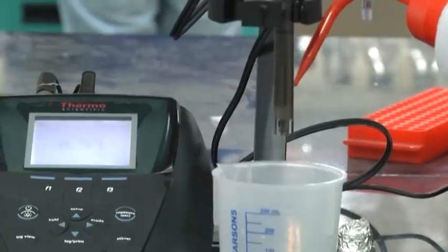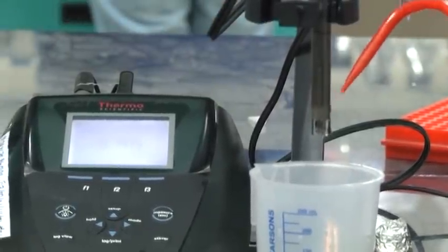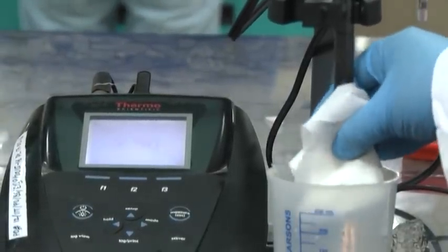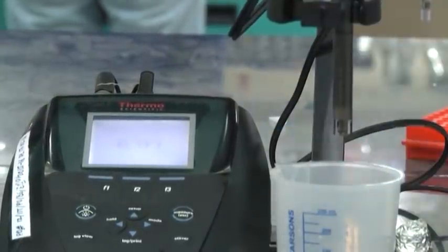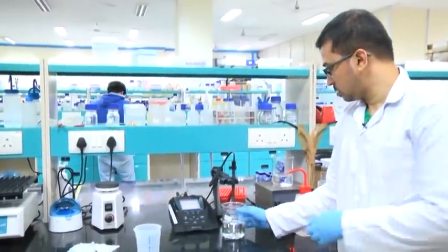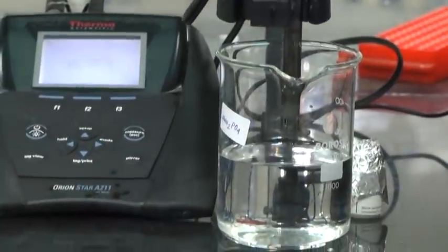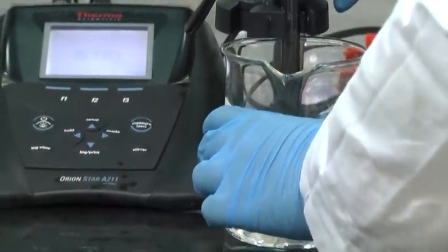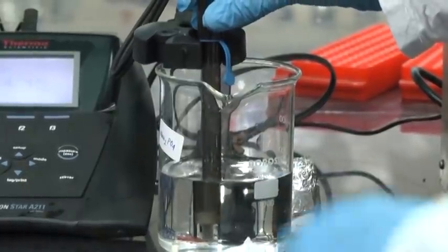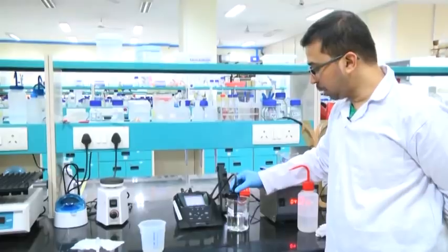Again we will add double distilled water and clean it — repeat 2 to 3 times. Now we will transfer the electrode into the solution; better not to keep it dry for a long time. We have transferred the pH meter bulb into the solution and here we can see the reading — the pH comes to around 4.35.